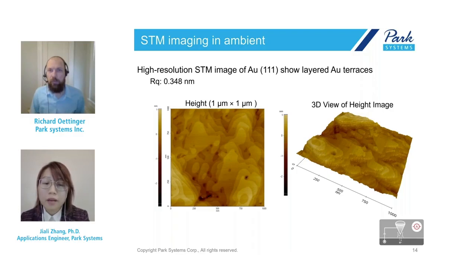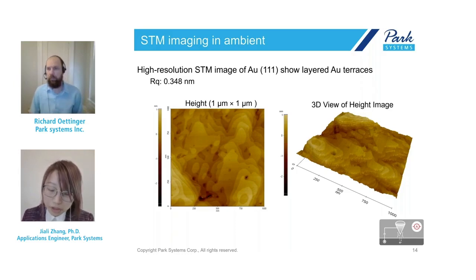This calibration sample is usually what we call 100 nanometer. It's a pre-fabricated height calibration standard with a height of about 100 nanometers, and it consists of silicon oxide structures on a silicon chip. And the silicon oxide structures usually have 10 micron or 5 micron pitches that are used for XY axis calibration. The XY and Z calibration will be conducted periodically to ensure the AFM scanner works with high precision and high accuracy. And I don't see why the tip radius will affect the calibration.